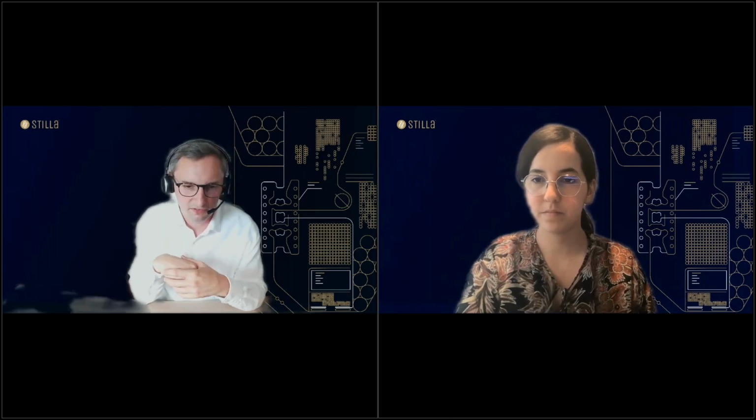The first question was, why is it so essential to grind and mix the sample well before testing it for GMO? Because you normally get 20 kilograms of feed, and inside of this huge amount of grains, you must find properly what is inside. It can be, for example, that there's just one grain on the bottom of the big portion, and by mixing it properly before you add it to the grinding, you ensure that it's not only on the bottom of the box, but distributed very well. With the grinding process, you also make it accessible for the later DNA extraction, because the smaller particles are then evenly distributed inside of the subsample for the DNA extraction.